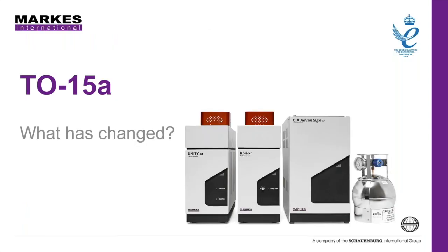Now, TO15A was released in March this year, and it was released by the EPA 20 years after the original TO15 method. TO15 has become one of the go-to methods worldwide for VOC analysis using canisters, and updates to TO15 were first mentioned in 2016 when the comments process started. So we've been expecting this for a while. So what has actually changed?